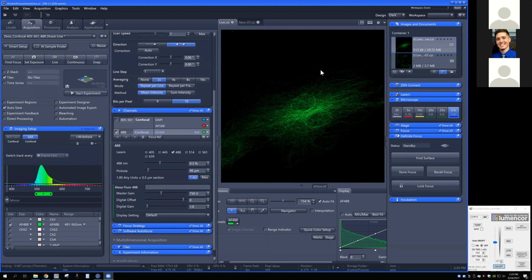So what we're going to do now is basically carry that conversation forward, specifically in terms of setting up the 980 as well. And we will do this for the confocal type channels that we've already worked with. We'll also introduce setting this up on the Airy Scan. And I think it's a good idea to do both of them today, even though we won't cover the Airy Scan in terms of imaging until tomorrow, just because they do represent the two different types of filter arrangements and settings that Cassandra just mentioned.